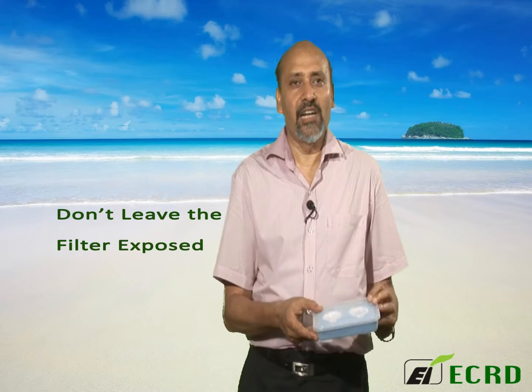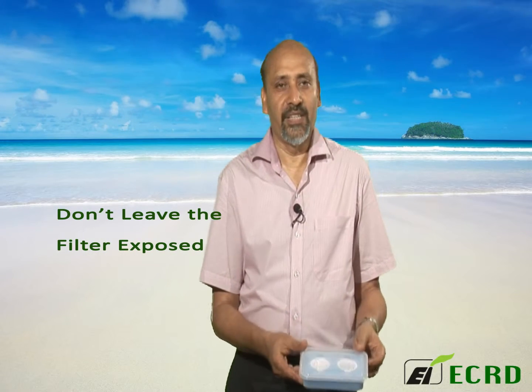Open the case, remove the blank cassette holder, place your loaded cassette inside, and immediately cover it. If you leave the filter exposed, dust particles can settle on it and interfere with your measurement. In the field, you will carry this closed box and then load the cassette onto your machine.